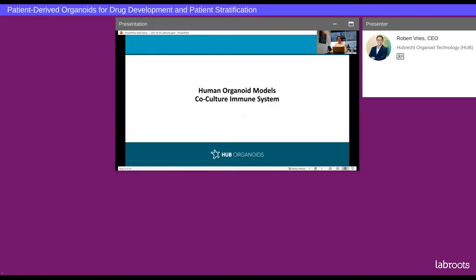So basically, what this means is that we have these organoid systems that on the one hand, as when we started out discussing cancer, we can use viability tests to test drug responses in different tumors and in different patients. And on the other side, because these cells are human and so close to patients, when we use the healthy cells, we can use them for toxicology studies, but also studies of inflammatory diseases like IBD or genetic disease. I didn't show that here other than the cystic fibrosis example, but these are cells that are relatively healthy and normal genetically, and they can be grown as differentiated cells, and the stem cells together will provide us a good picture of what the disease looks like. For the last bit of the presentation, I want to show another recent example.